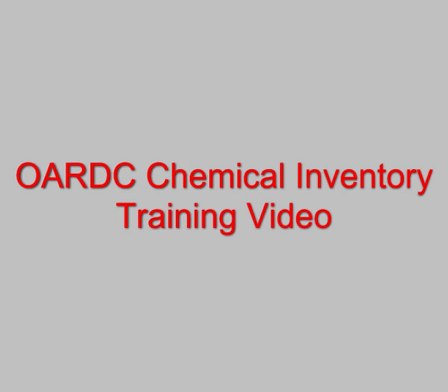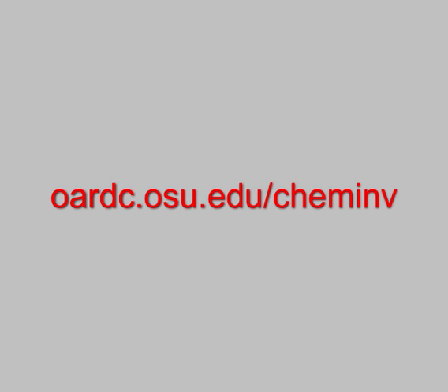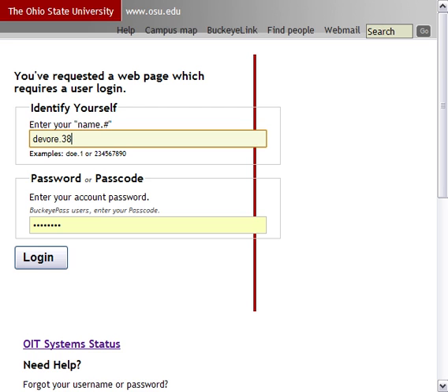Open a web browser such as Firefox or Internet Explorer and type the following in the address box: oardc.osu.edu/cheminv and press Enter. At this point, your web browser will be redirected to a page which will ask you for your OSU name.number username and password. This username and password is the same as what you use for your OSU email account and various other OSU systems. Once you've entered your username and password, click the Login button.